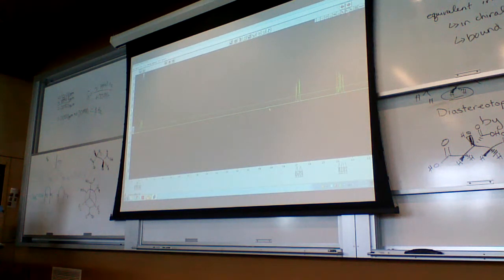This spectrum also has two other signals that are also doublets of doublets. Doublets of doublets are pretty easy to tell that they are doublets of doublets, because you're going to have 4 lines and they're all going to be equivalent. And we want to look at these and measure their coupling constants. So we've got a 3 hertz there. That's great, because we have to find the coupling constant that matches this one, right? This one. We need something that's going to couple between this signal and the other 2 signals.